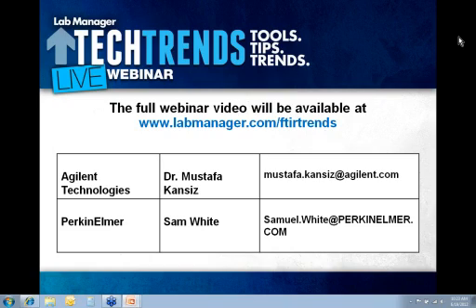Yeah, well, once again, Sam, I certainly agree. I think when it comes to Raman microscopy, there are pros and cons, and one of the other pros of a Raman microscope system is the small spot size and enhanced spatial resolution, but they're typically very low signal to noise. You have issues with fluorescence, which can be a real killer. Most samples will have some degree of fluorescence, and to get a good system, it is a relatively expensive system as well.